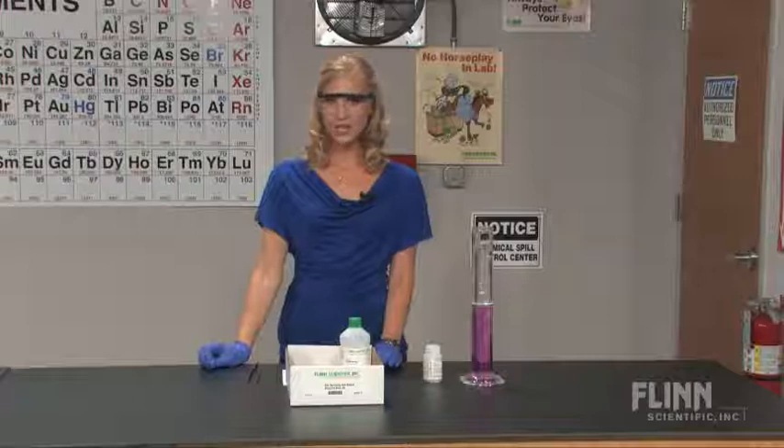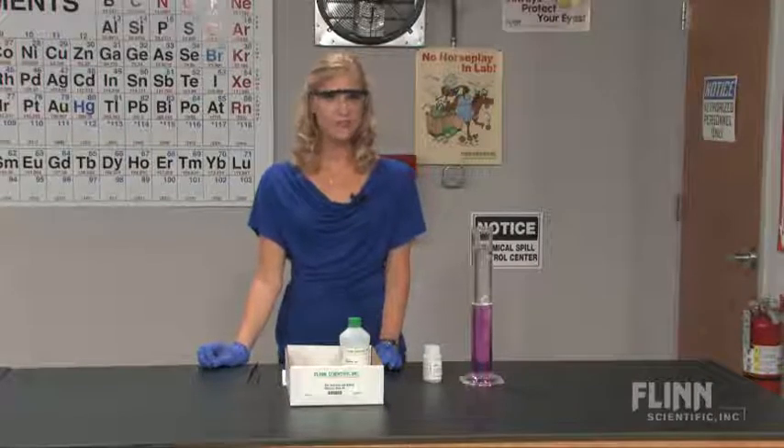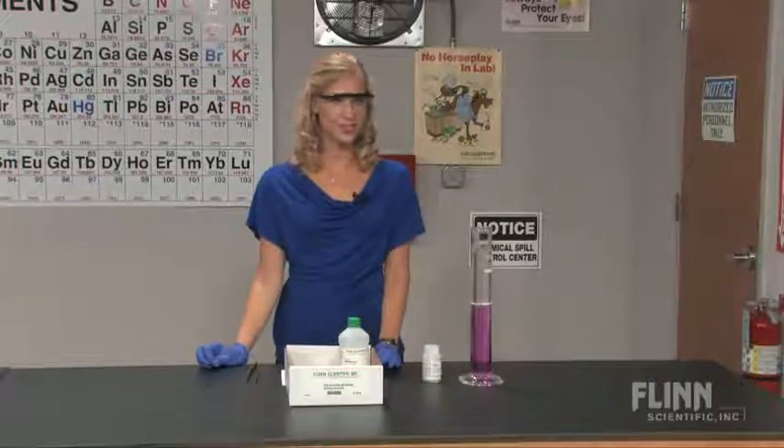The kit includes pre-cut sodium metal pieces, mineral oil, and phenolphthalein — everything you need to make a splash with your students.